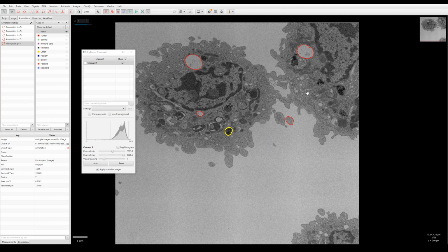Those can be very quick and useful ways of drawing around things that are quite complicated, as long as those complicated things have very similar intensities in the pixels, meaning the gray, white, or black intensity across the object you are interested in is very similar. So I hope this gives you an introduction to what you can do with QuPath as you get SerialEM images from the Microscopy Services Lab. As always, if you have any questions, please let us know and we will try and help you out.